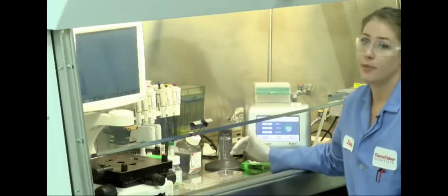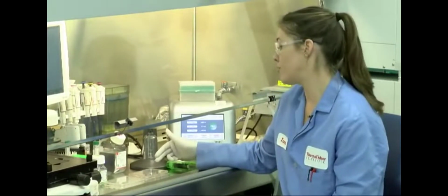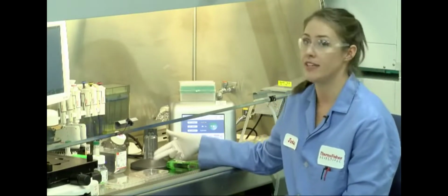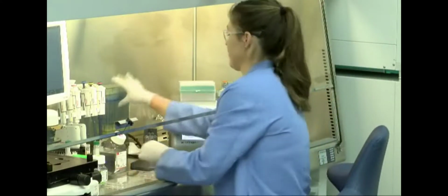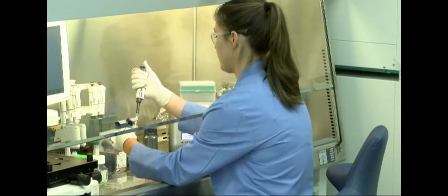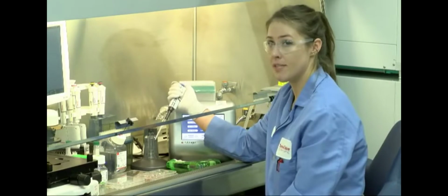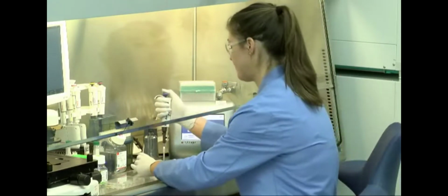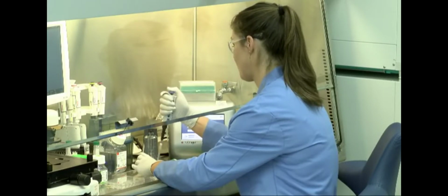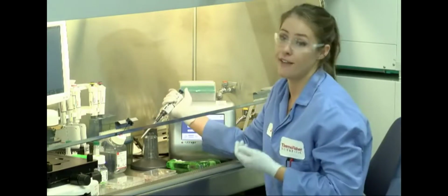To neutralize the TrypLE Express that we put on the cells, you want to add 1 volume of your culture media to the amount of TrypLE Express that you have in the well. I'm going to add 1 ml of my StemFlex plus RevitaCell on top of the TrypLE that's in the well right now. Then you can rinse your well a couple of times to make sure all of the cells come off of the plate. Then you want to collect all of your cells in a 15 ml conical.